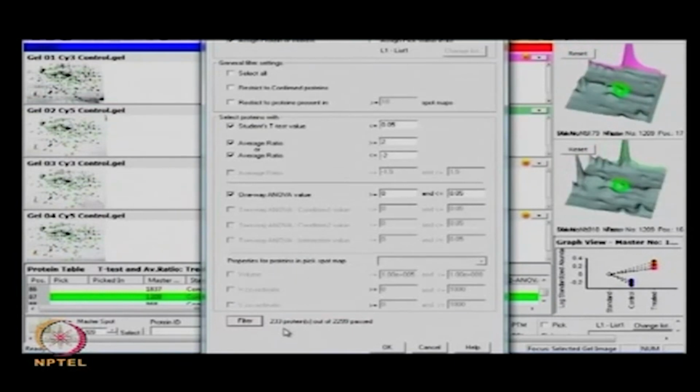So, can you elaborate on what EDA, or extended data analysis, is, and what it can do which we are unable to do in BVA? So there are layers here, right? One is DIA followed by BVA, and then ultimately EDA analysis. Exactly. Basically, what we can do here is compare two BVAs together. Here we are talking about a particular disease or a particular set of data only. There we can analyze different BVAs together in EDA. There you will get differential expression, as well as PCA and discriminant analysis. These kinds of statistical data you will get in EDA. Very shortly, I will show you briefly.